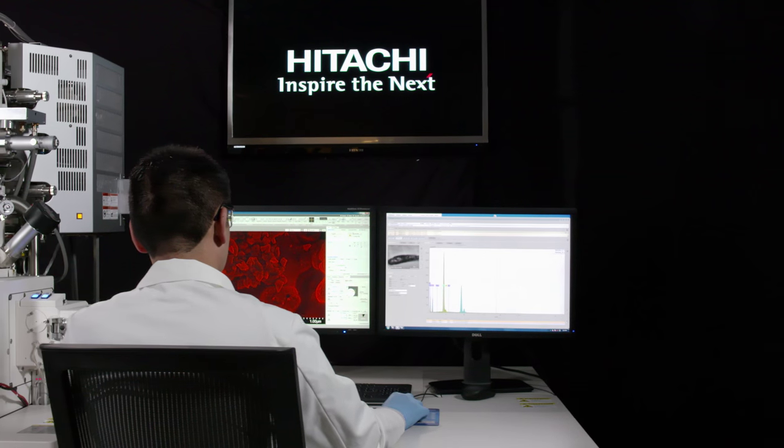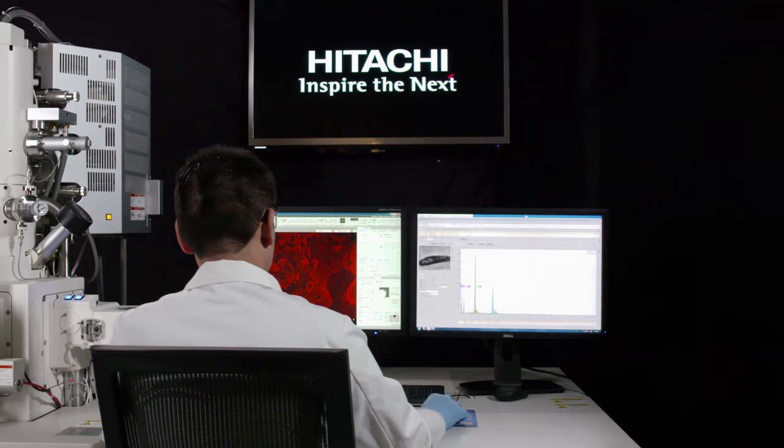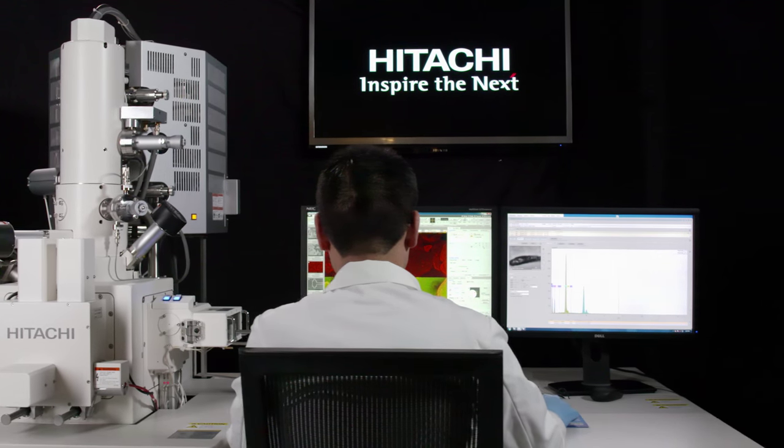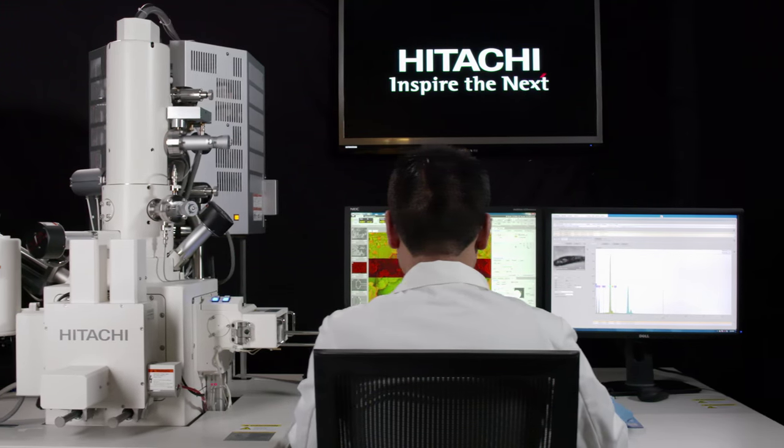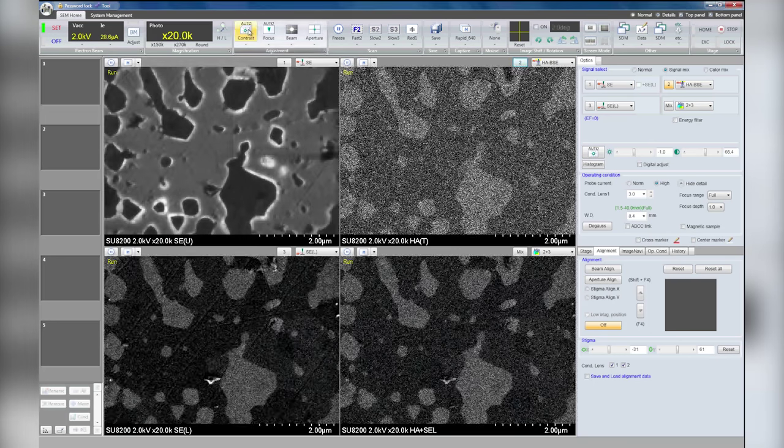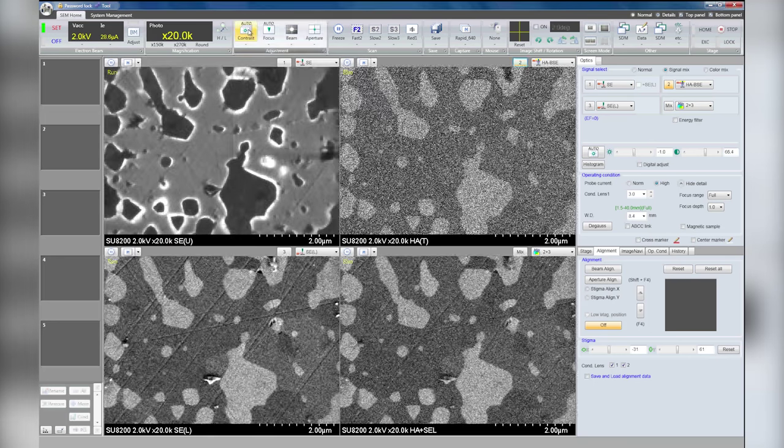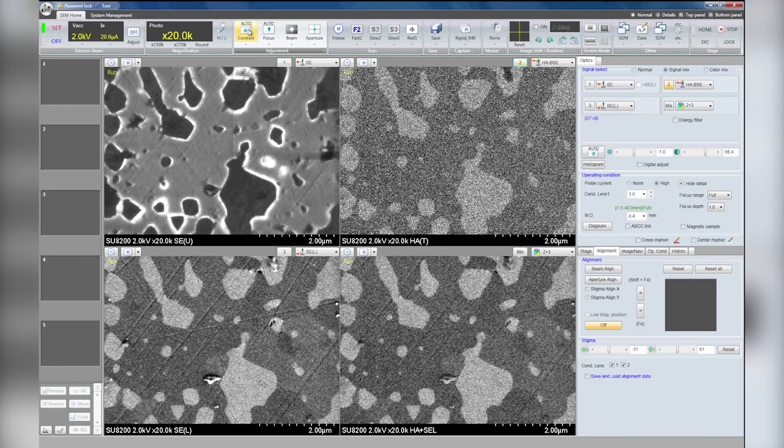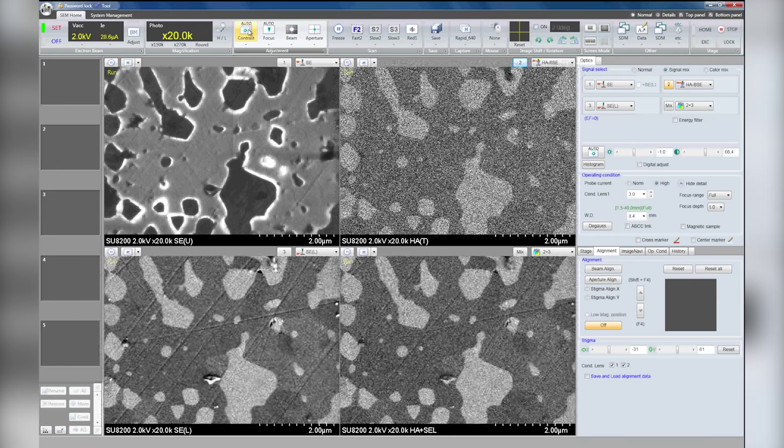The SU8200 series FE-SEM provides unsurpassed image observation and microanalysis at low acceleration voltage conditions, as well as delivering unmatched beam brightness and stability.